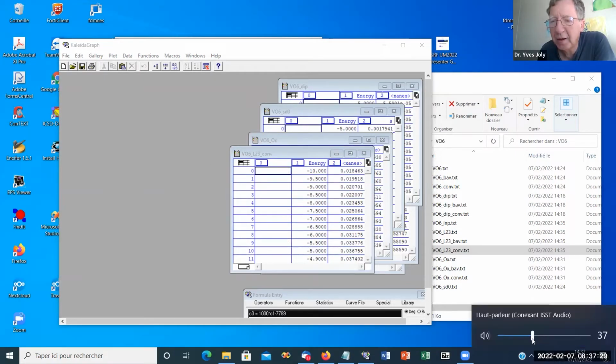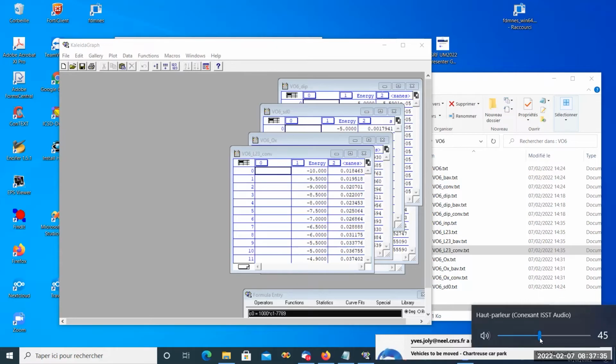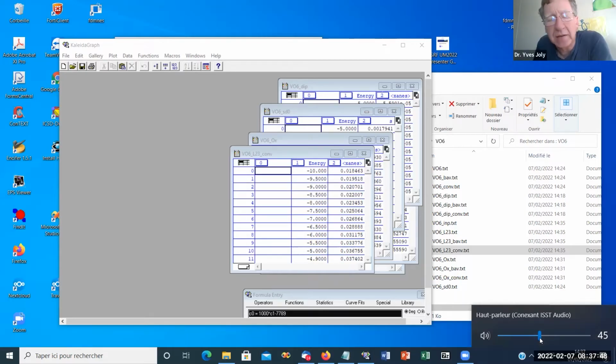Please. Oh, yes, sorry. For the spectra that are simulated, I was wondering what is the origin of the first signal that is very far below the Fermi level. There is usually a very intense peak, but it doesn't appear in the convoluted data. Yes, it was about the beginning, right?